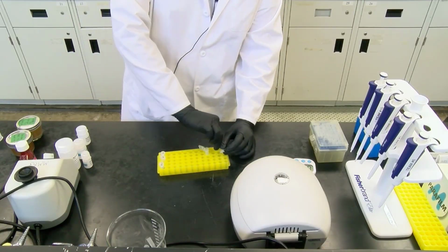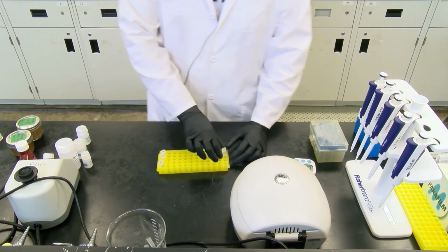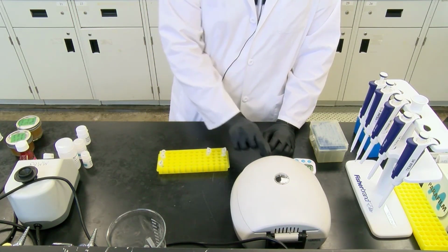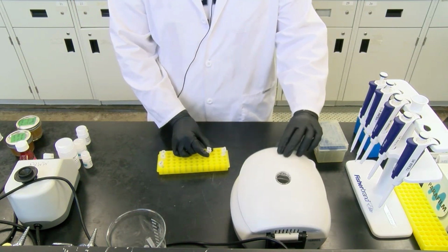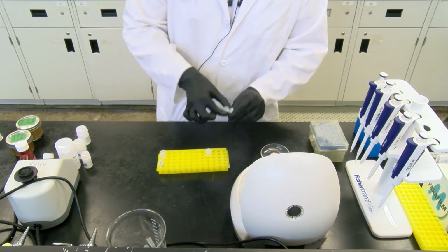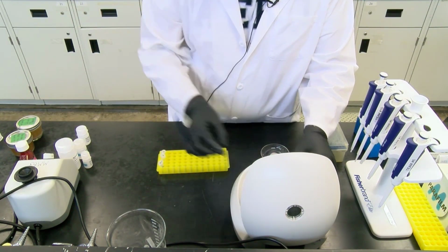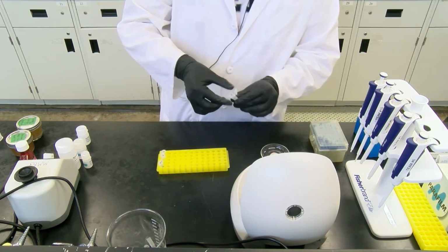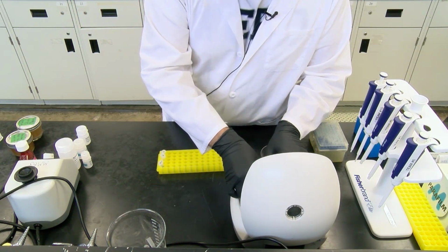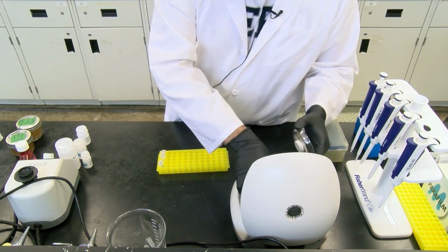Now we're going to spin the columns one last time. Make sure the inner column is closed so you don't want your DNA to contaminate it. So make sure the settings are the same settings we've been using the entire time. Make sure the inner column is closed. That's the most important one. The outer column probably won't close, but that's alright. Inner column, make sure they're staggered and the open column is at least going into the center. Now we're going to close it, make sure that they're opposite of each other.